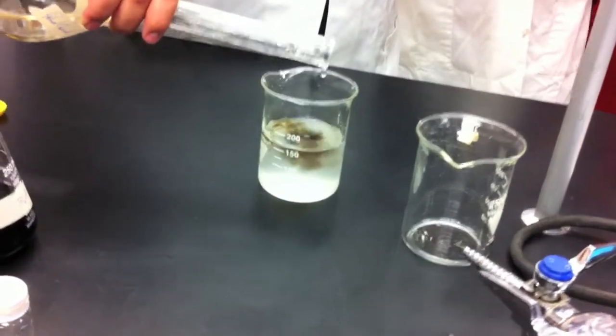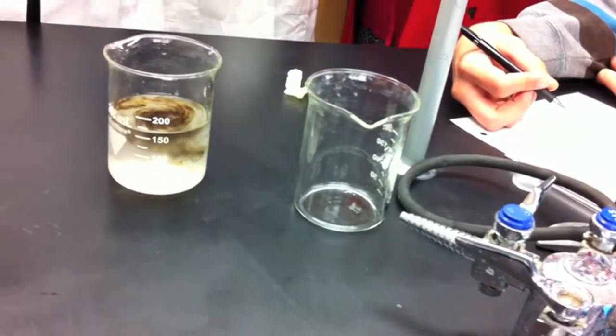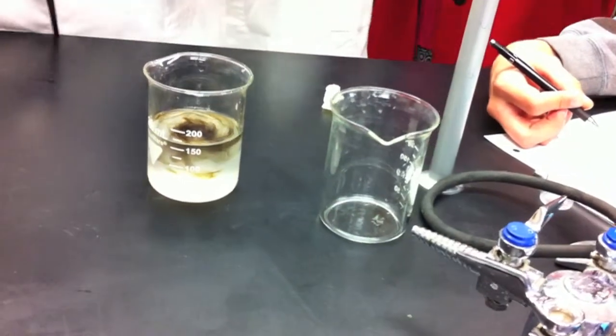What do you think is happening? The reaction is finished when it turns black. What do you think is happening here? How come it isn't quite like that?